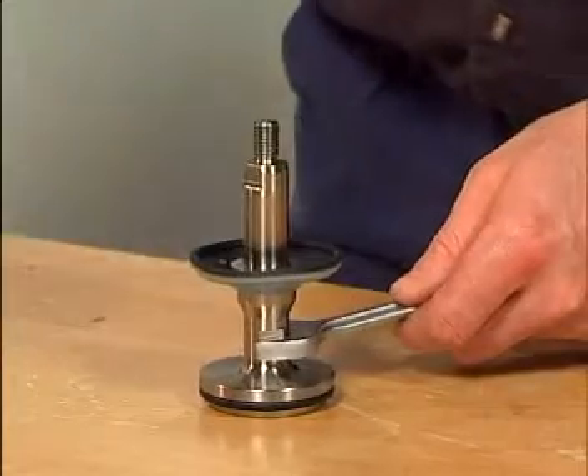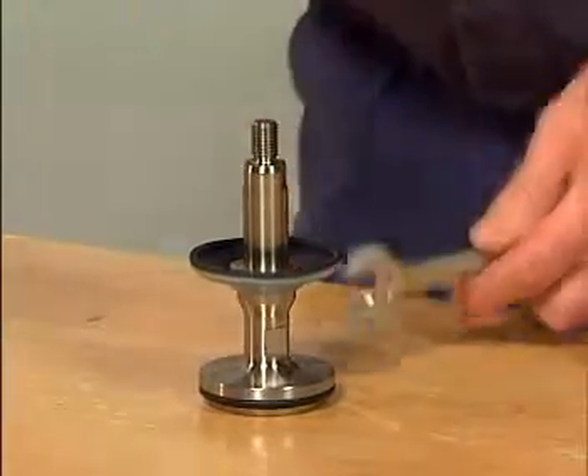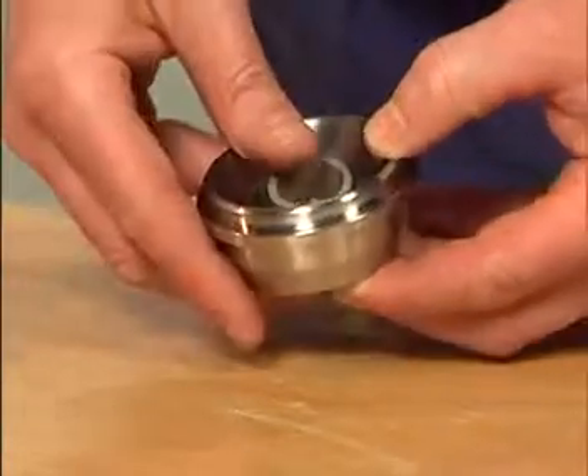Use two spanners to firmly tighten the two parts. Place the composite bushing so that it snaps into position.